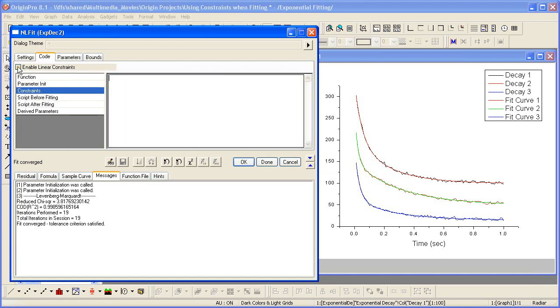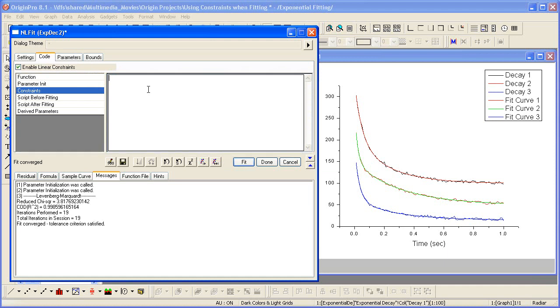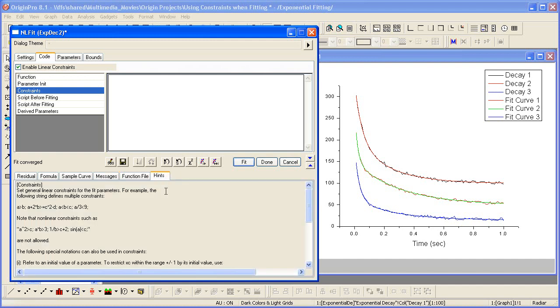Let me check the Enable Linear Constraints checkbox. What I enter here will be used. If I click on the Hints tab at this point, I'll get some hints on how to enter constraints.